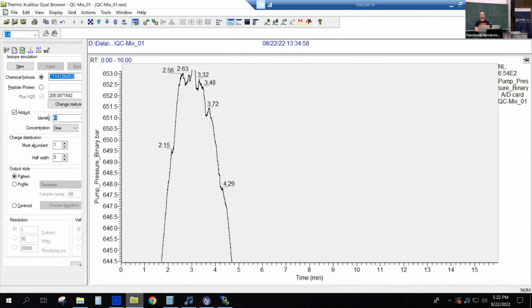Maybe try to change the composition of your eluent. That's what we do in order to have both pumps running. Okay, so 95 is better than 99. Like 5% A and 95 B. I like to switch them. Interesting. I'm going to look up the chat. Maybe I'll write her offline.